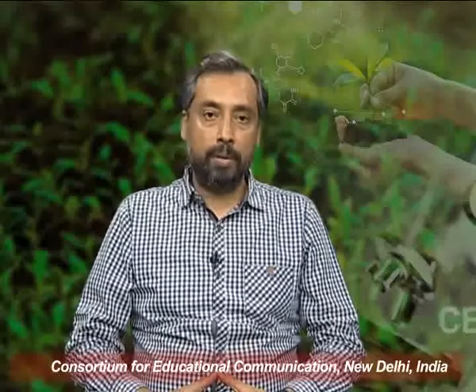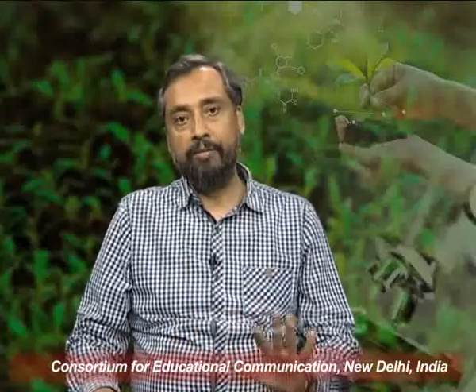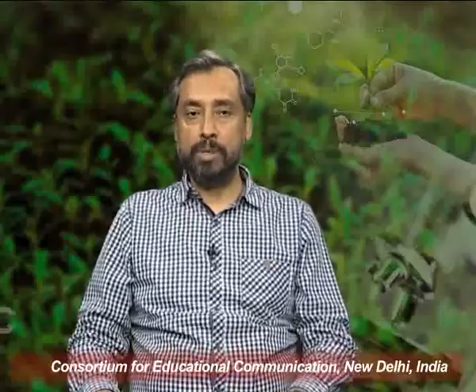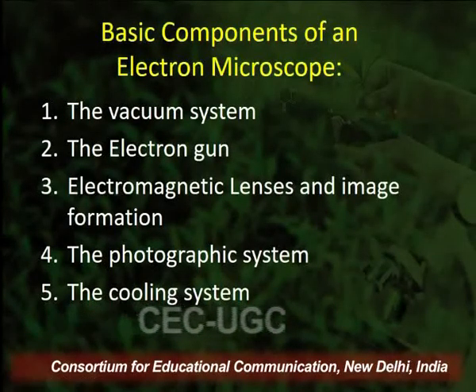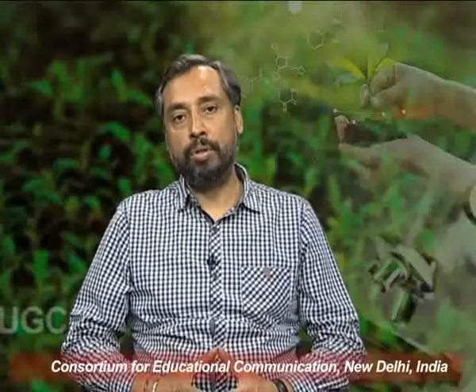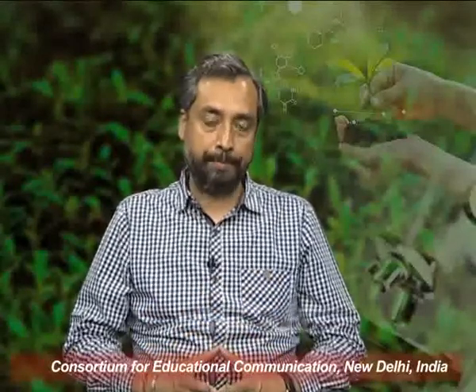So the entire electron microscope could be divided into 5 basic components. The first component happens to be the vacuum system. The second one is the electron gun. Third one is electromagnetic lenses and image formation. The fourth is the photographic system, and fifth, the cooling system.